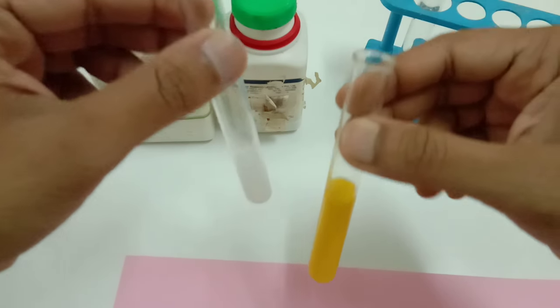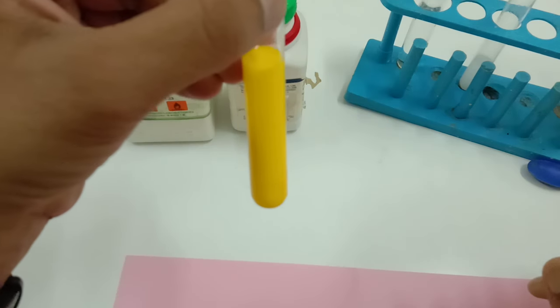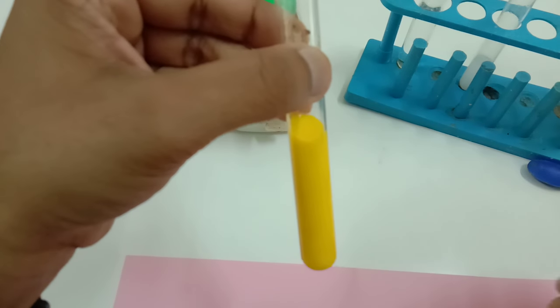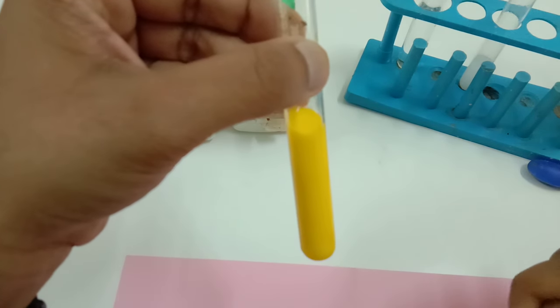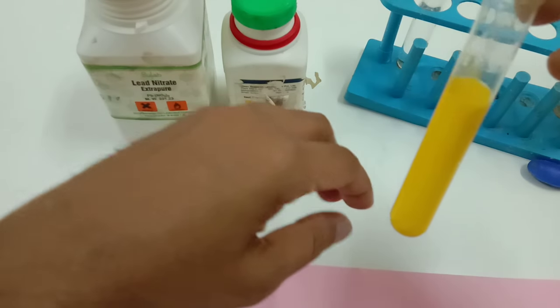There you go people, fantastic. So here as you can see that the precipitates have formed and the precipitates are yellow in color. Now let us find out from the reaction which is this yellow precipitate over here.